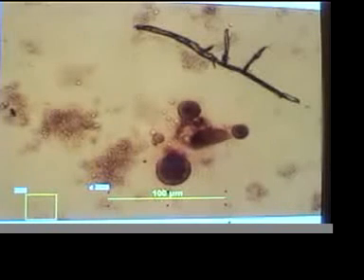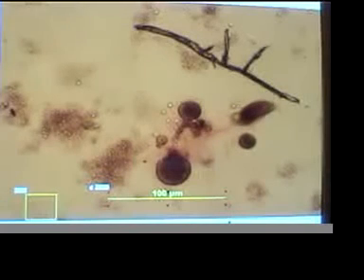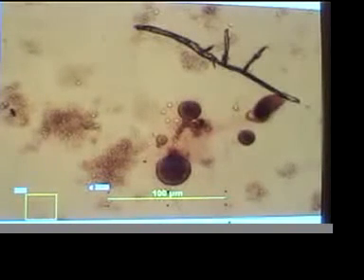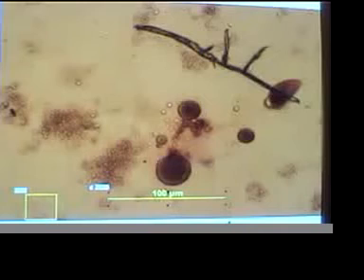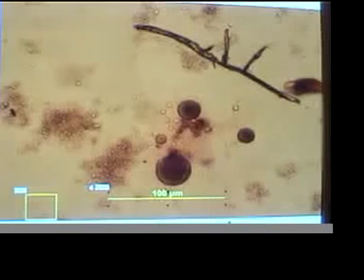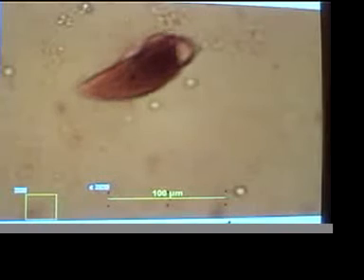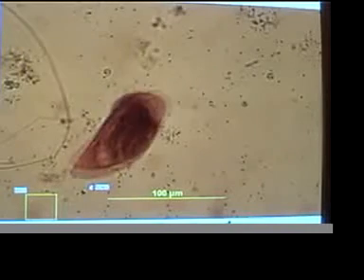And yet, not far from him, and look, this little piece of him is trying to swim away. That's amazing survival strength, isn't it? And yet, not far away, we see many who are not. So there he is. He's pretty small, so let's try to zoom in on him a little bit. There he goes. He's still slipping. Or is that a piece of that one who exploded? I'm not sure.